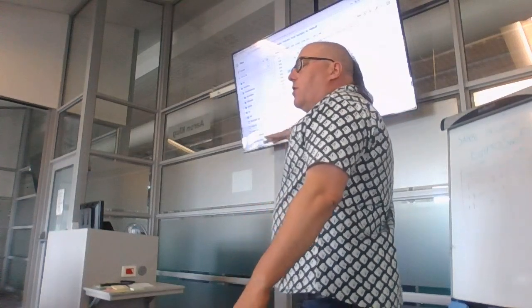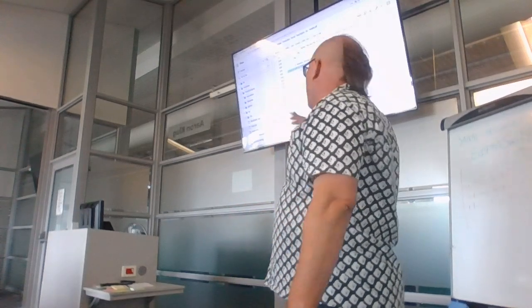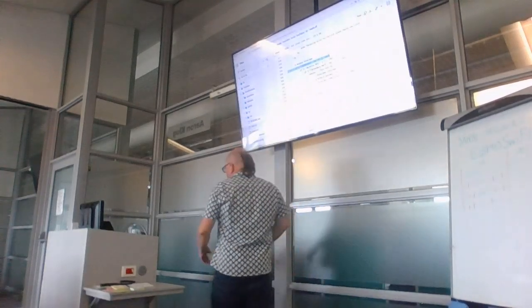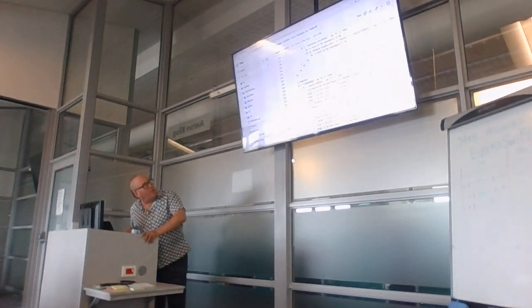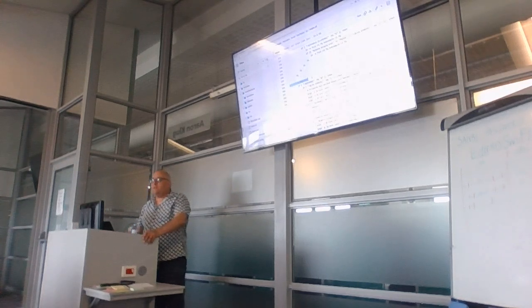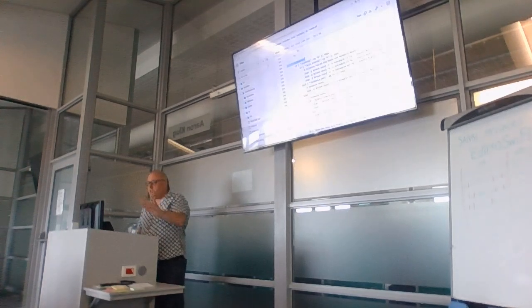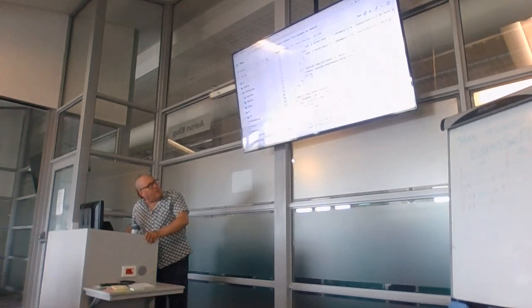using different commands. So sometimes you don't want to have massively high coverage on your genome. So optionally it's reducing the coverage to a maximum amount, okay? And then lots more stuff. And finally, it compresses your reads. If it's uncompressed reads, it makes it into compressed reads. pigz is parallel gzip. Okay, so it's just gzip that you've seen before for doing compression, but a parallel version. Okay, and then it does some various things with it.